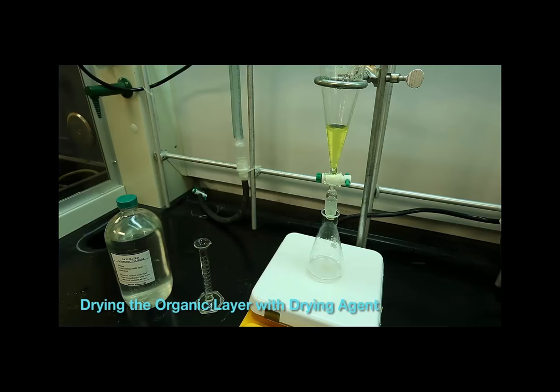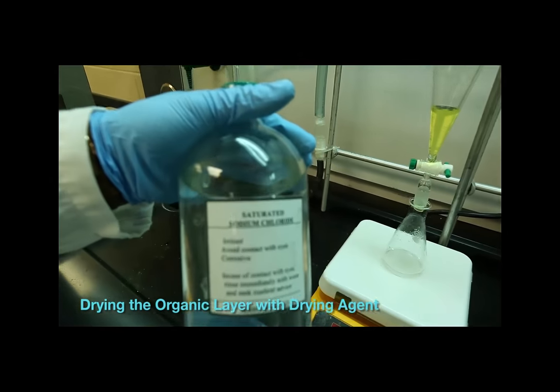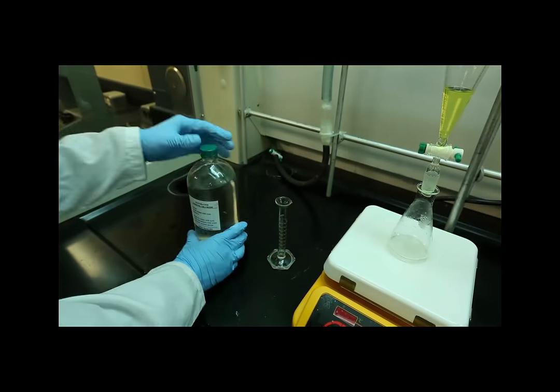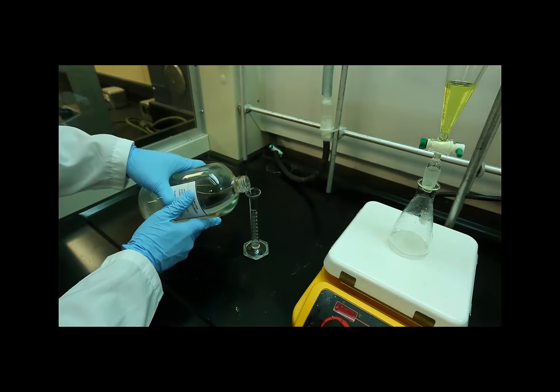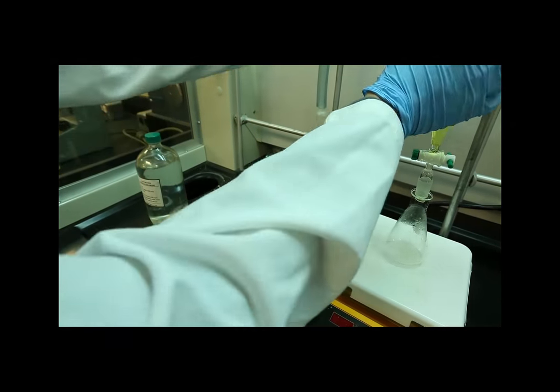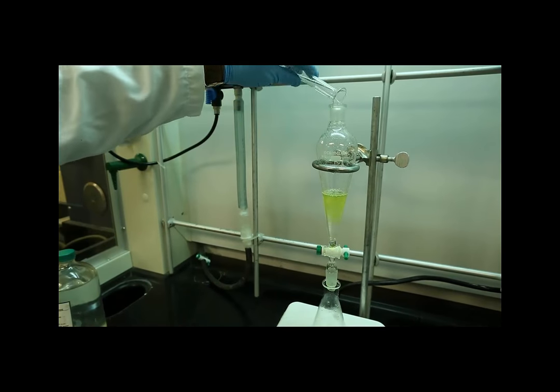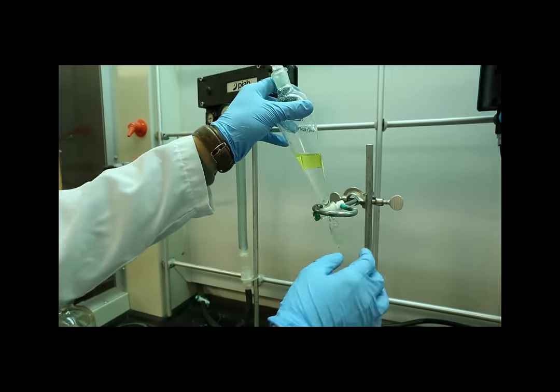Once you have successfully isolated your organic layer in an extraction or washing, it is important to remove any excess water contamination. This is a process known as drying. The water is crudely removed by washing with brine, a solution saturated with sodium chloride.